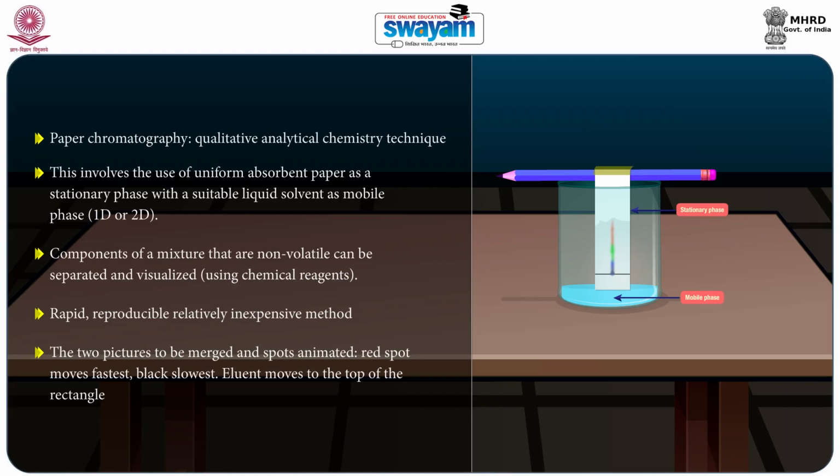Now again, a schematic diagram here shows you an overview of the whole process. The previous slide essentially showed what the ink will look like once it has been separated into the component colors. But a typical chromatographic setup for paper chromatography looks like this. The paper onto which the separation is to take place is first placed in a beaker with some amount of solvent.